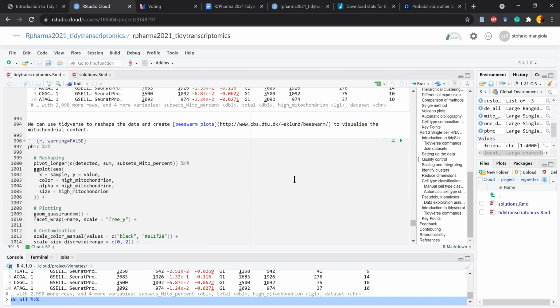Okay, the next block is how usually after we calculate the statistics, we do some visualization to see the distribution of possibly dead cells. There are many ad hoc visualizations from Bioconductor where we can visualize these properties.